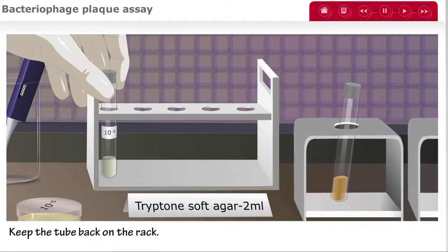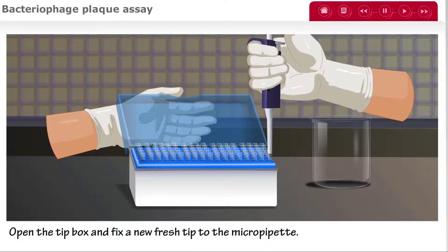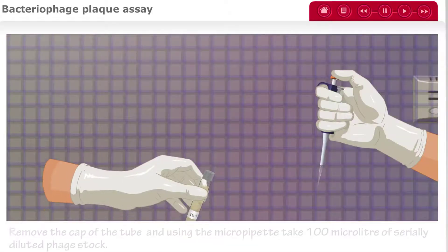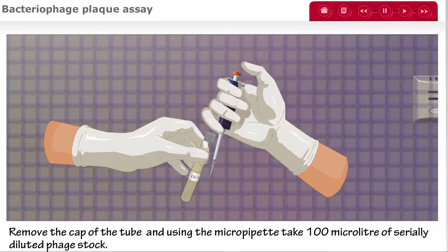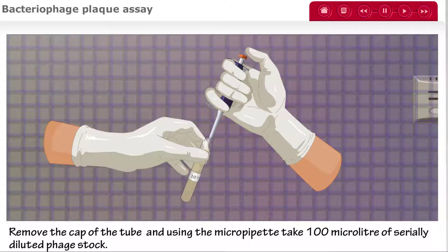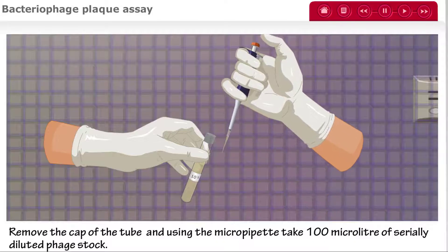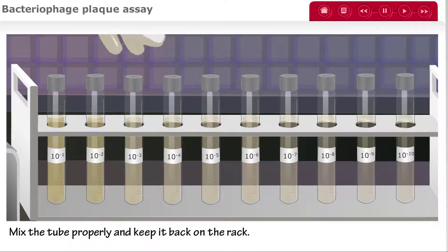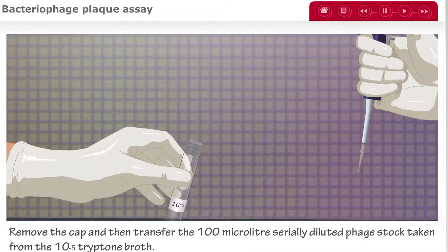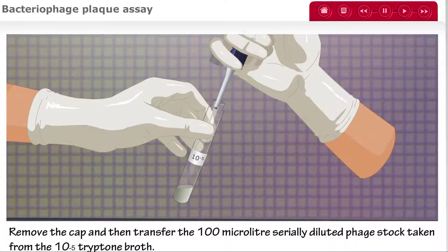Take a micropipette and adjust it to 100 microliters. Open the tip box and fix a fresh tip to the micropipette. Take the tryptone broth tube labeled 10 to the negative 5, remove the cap, and using the micropipette, take 100 microliters of the serially diluted phage stock. Replace the cap and mix the tube properly before putting it back on the rack. Take the soft agar tube marked 10 to the negative 5, remove the cap, and transfer the 100 microliters of serially diluted phage stock into it.